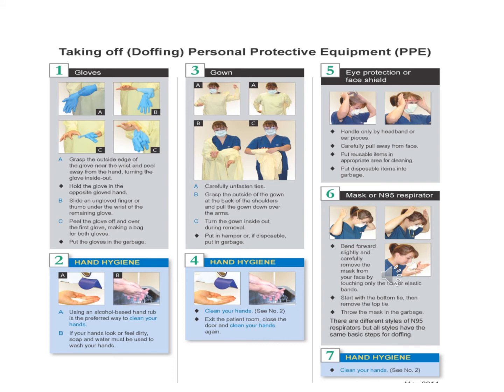If your hands will be free, then of course you should use your hands while removing other gear like a shield, or anything else you are wearing. So remove the gloves and follow the steps to remove them, because definitely your gloves are contaminated, right? In the personal protective equipment lecture, we already covered how to remove the gloves, right? So here you can see how to pinch from the lower side and remove the gloves.